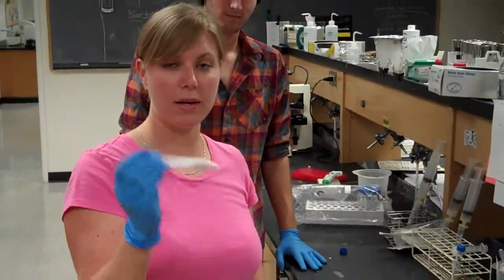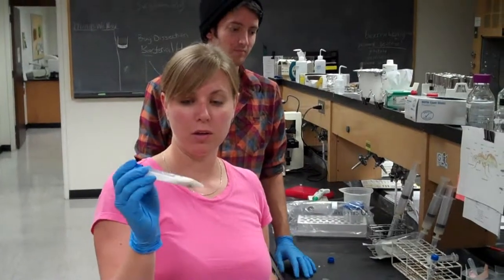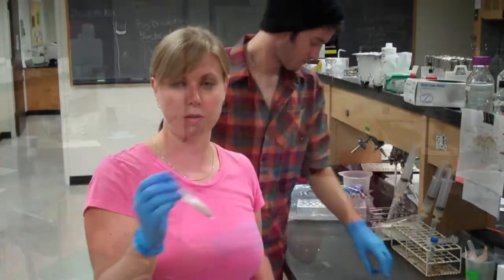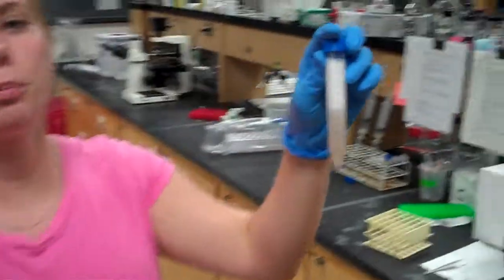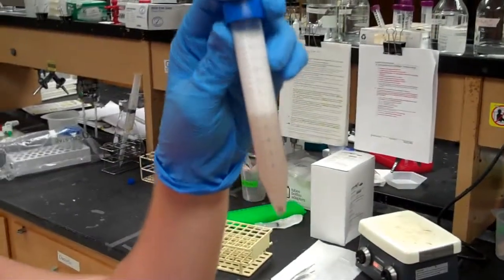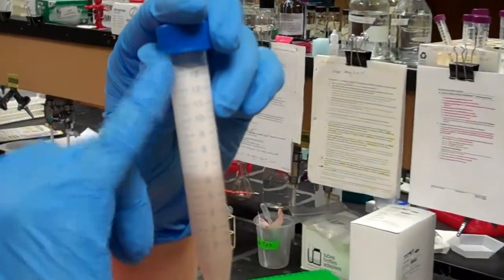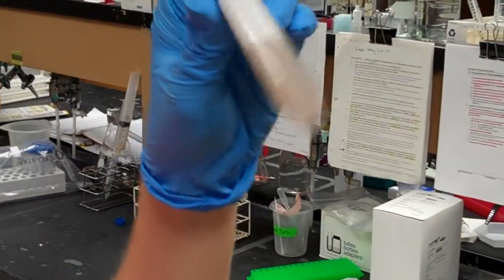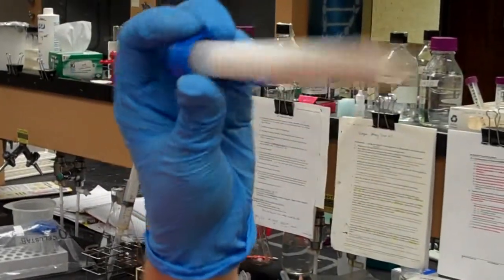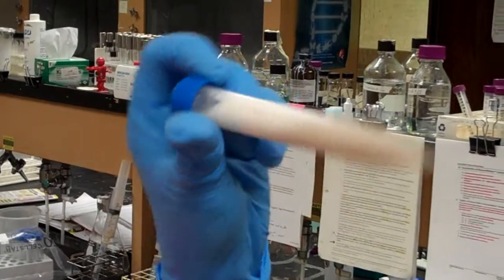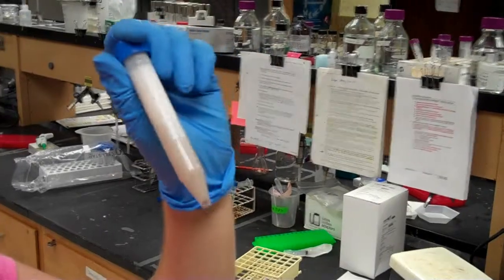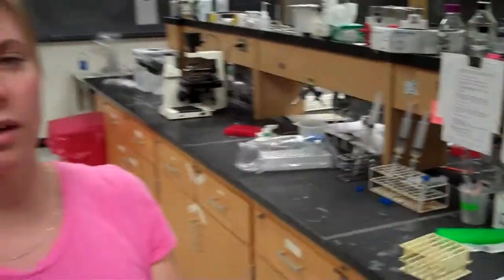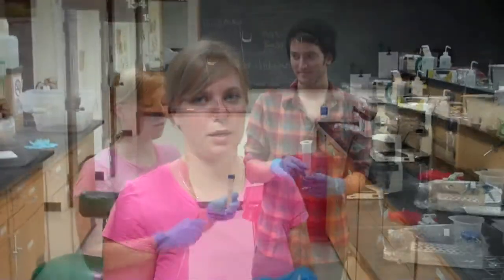You can also add additional phosphate buffer to this mixture to help it go into solution better. So your consistency after you add your Brij solution with your pellet should kind of look like this. You'll have a lot of bubbles up at the top, but you want to make sure that it's not very soapy and it moves easily. So now what we're going to do is centrifuge this at 16,000 RPMs for 15 minutes.